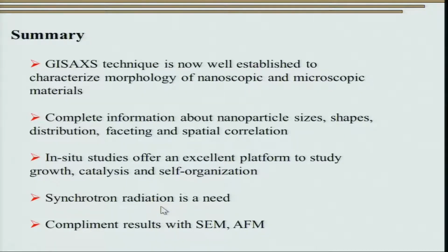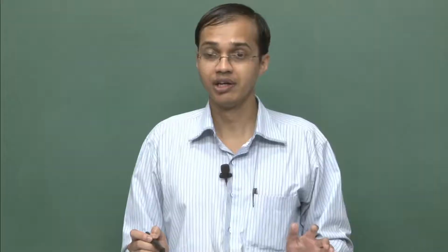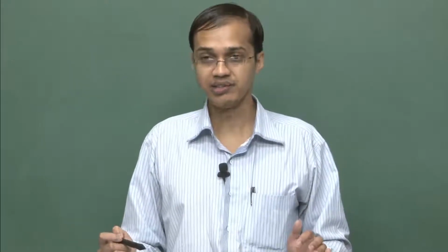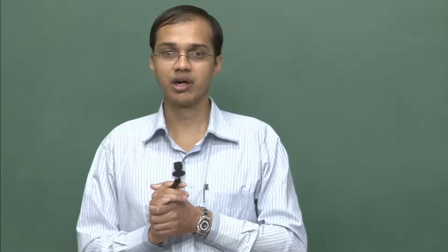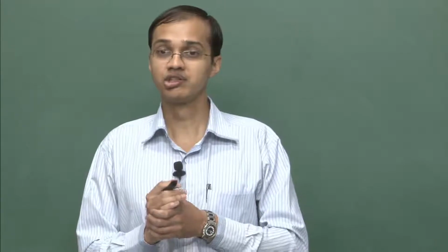synchrotron radiation is necessary for doing good quality grazing incidence small angle X-ray scattering, and having done grazing incidence small angle X-ray scattering, it is always a good idea to confirm your results with other techniques like scanning electron microscopy or scanning tunneling microscopy or AFM. Having said that, grazing incidence small angle X-ray scattering, though not available routinely, offers a very sophisticated tool to study the structure of materials at the nanoscopic scale.